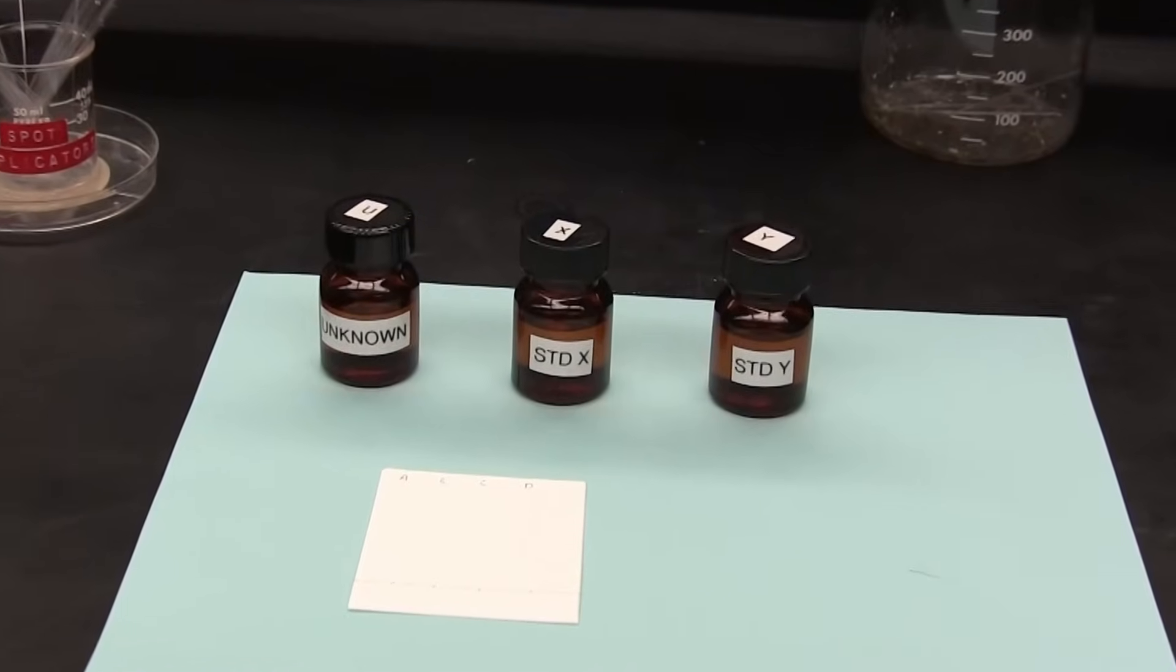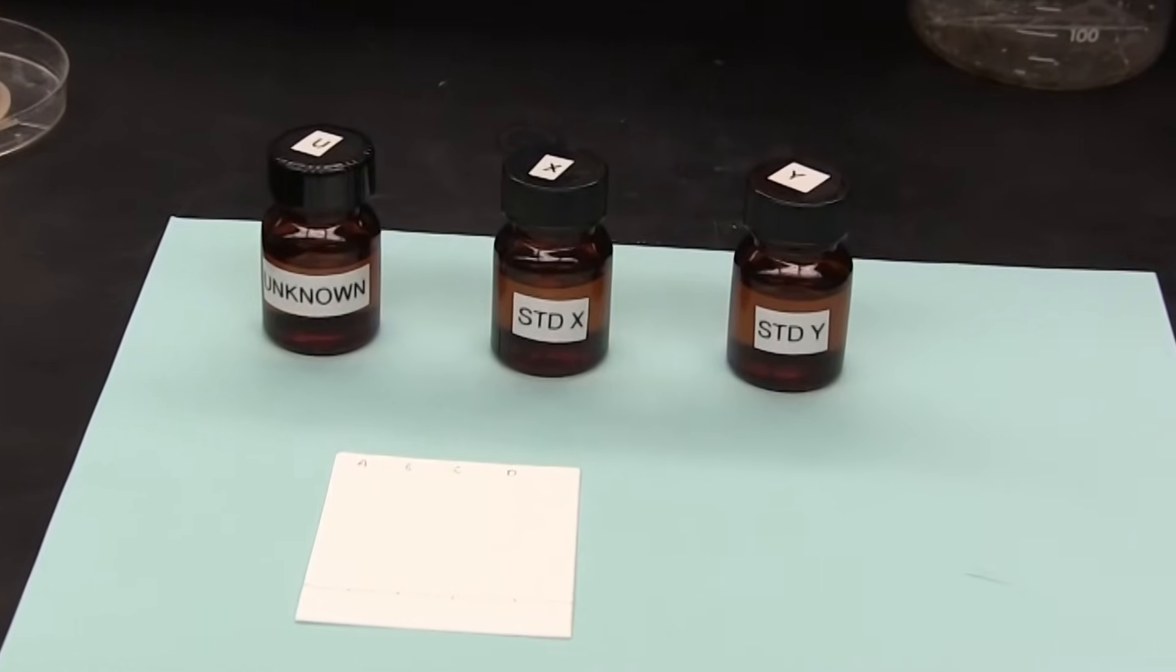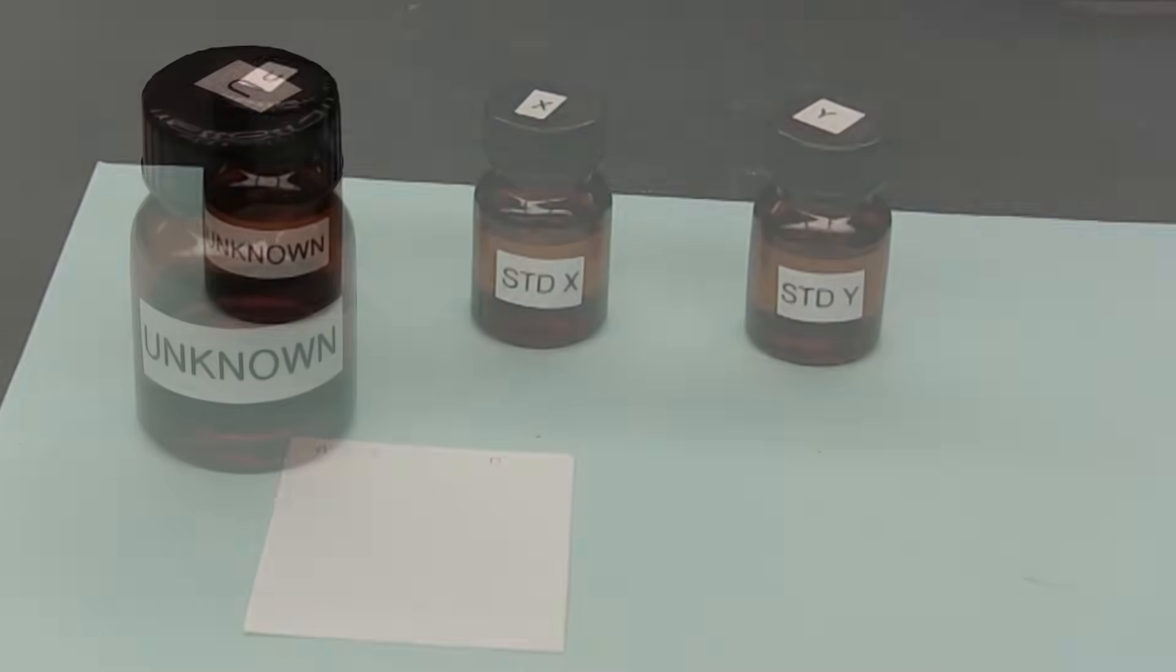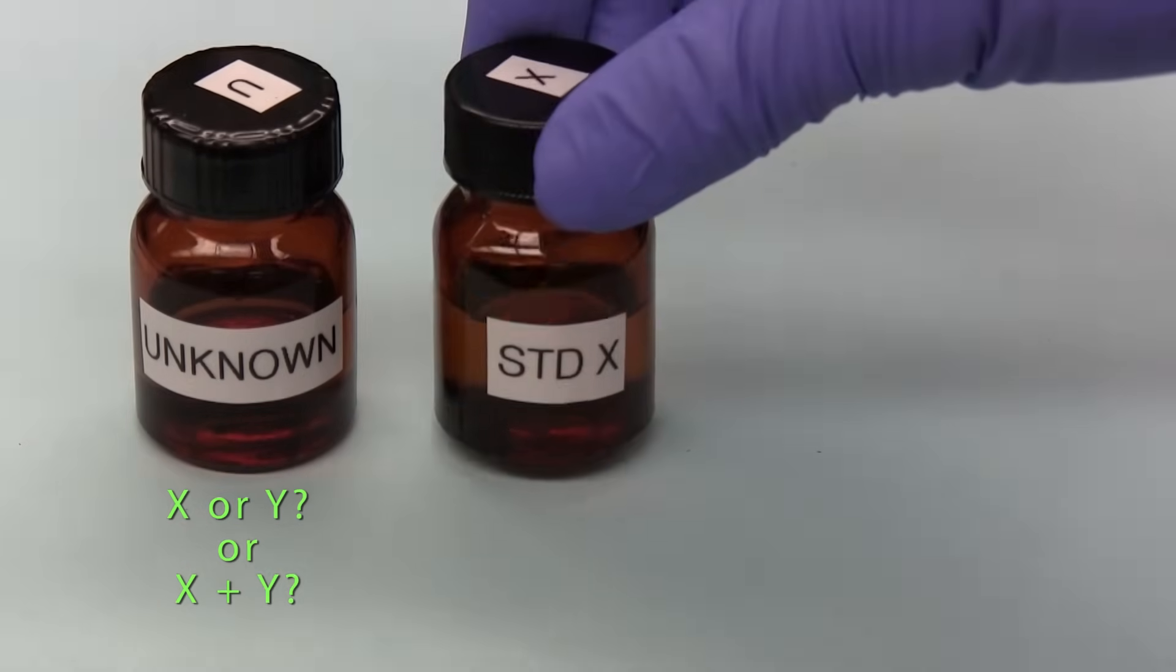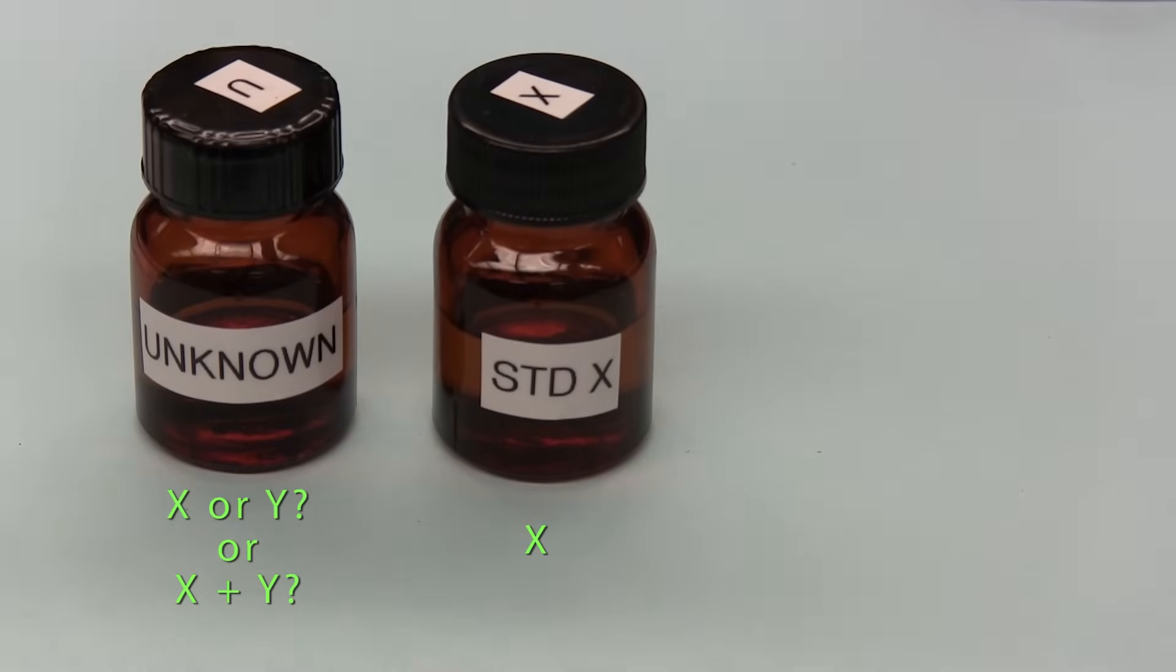In this demonstration, we are going to see how to separate and identify using TLC. In this bottle, the identity of the contents is unknown, but we do know that it contains either compound X or compound Y, or even a mixture of both. In this bottle, we have an authentic sample of compound X, a sample which we know beyond any doubt is compound X, so we call it standard X. This is our first reference.